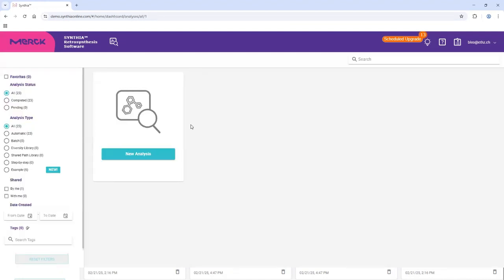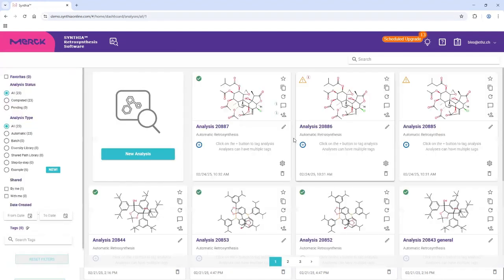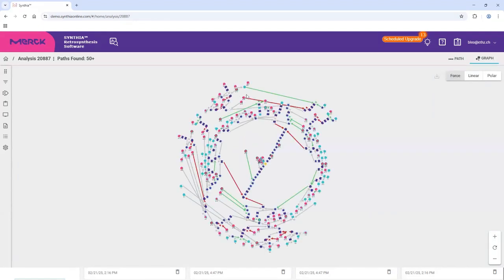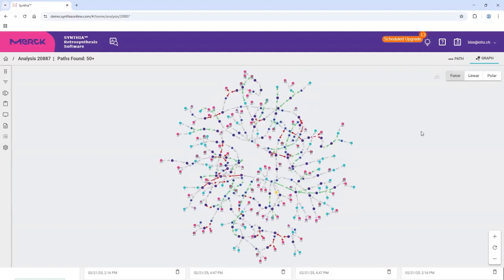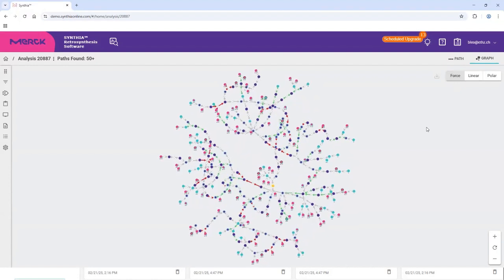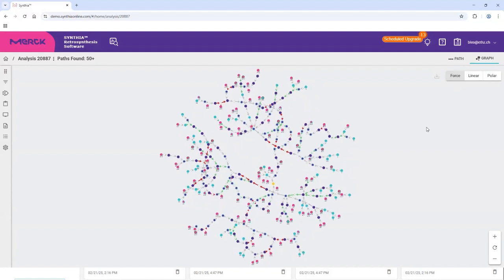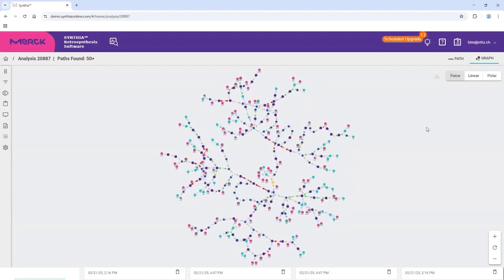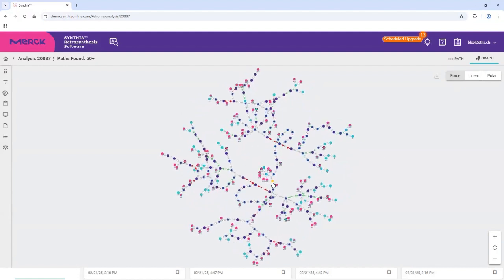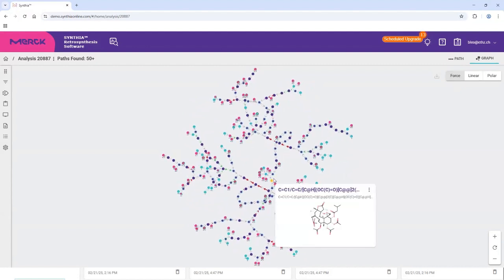And maybe for that, I want to show one last example that I just tried before with this highly complex molecule, where I was astonished that I got even some results. So here I had to run the algorithm several times and do many iterations to get anything at all. It's also not all that promising. And you see here now, you have a complex network. You have starting points that go together from different places, that you could go to the same intermediates. And again, here we see in blue, so there's a color coding system that you could look up with the legend.